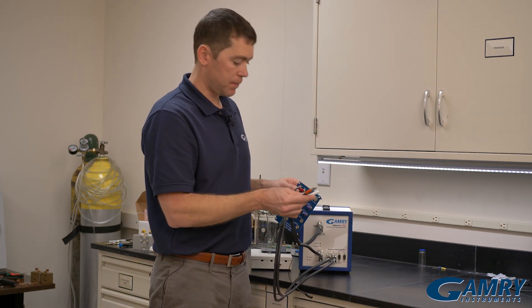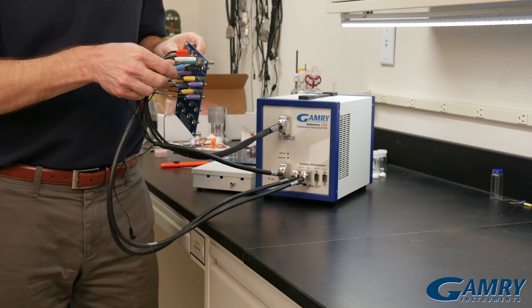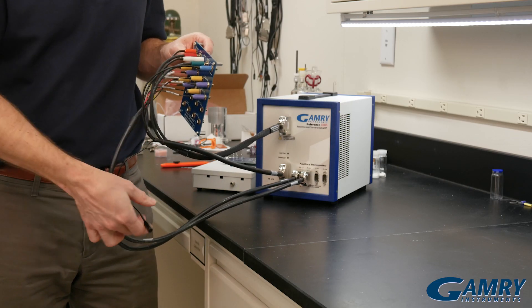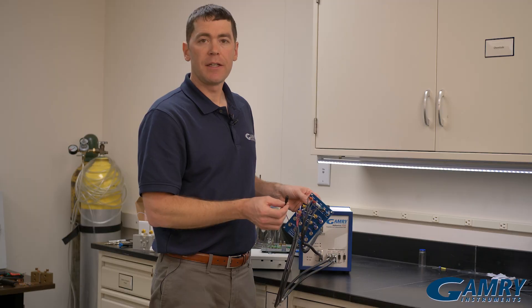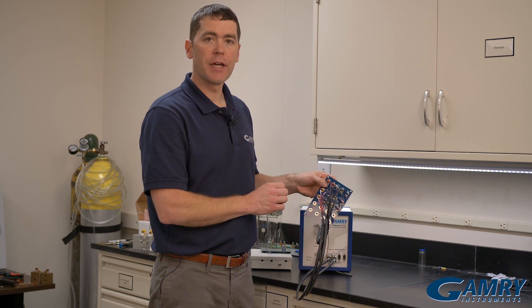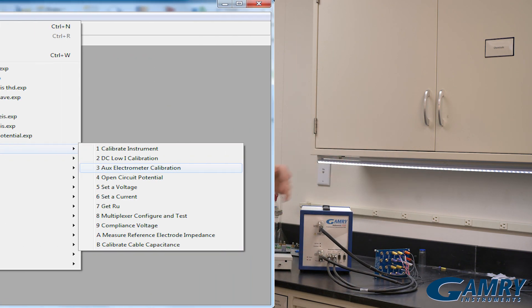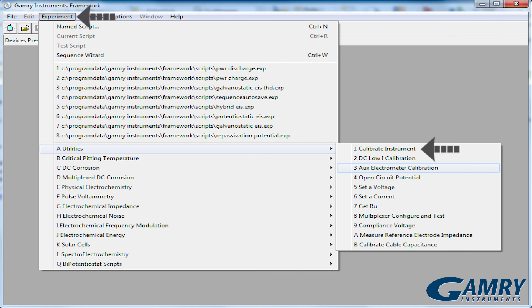Now I'll connect my sense leads up. In this experiment, the black lead is not used here — you can let it hang free. Once all the connections are made, I'm ready to run the calibration. I simply go into Framework, select Experiment, then Utilities, then Calibrate Auxiliar Electrometer.